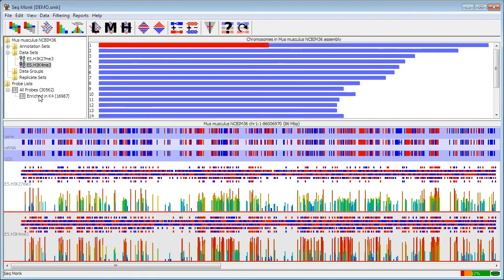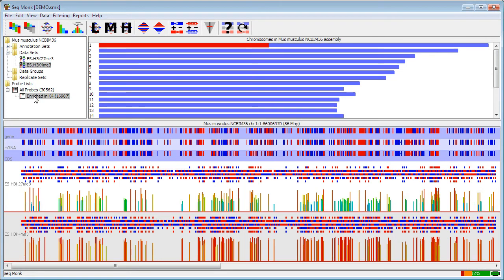Once you've made a filtered list within SeekMonk, if you select that filtered list, your display will immediately update to show only the probes that are present in that filtered list, and all of the other views, graphs, and analyses that you run will use only the probes that are in the currently selected filtered list as their starting point.